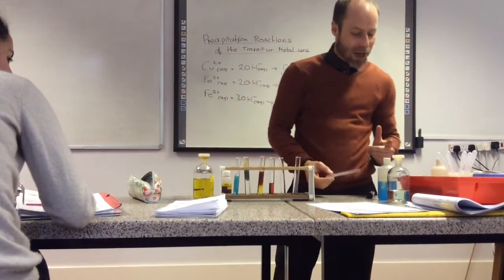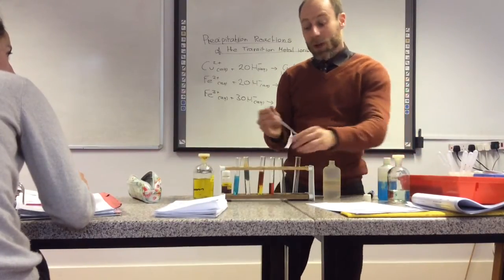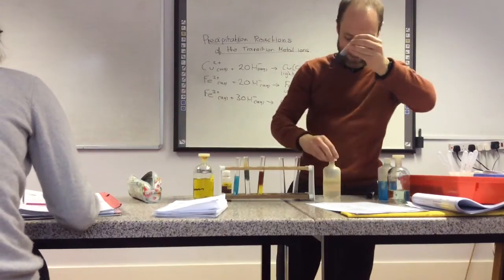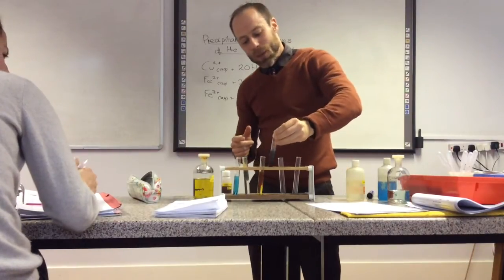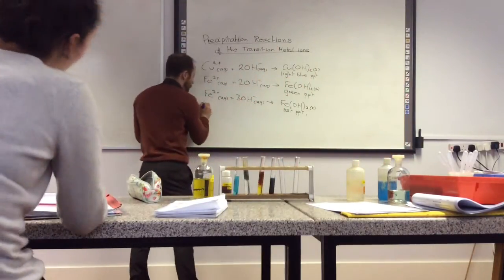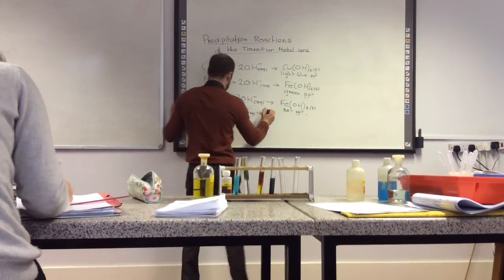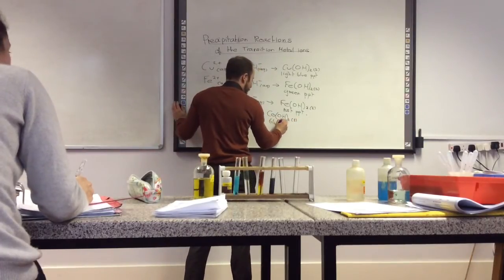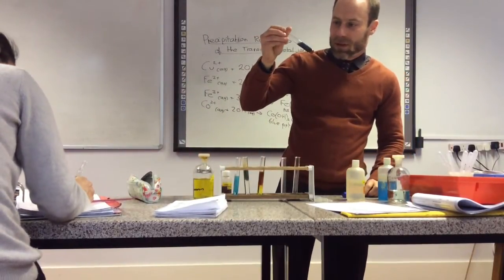So we're going to add — can anybody tell me the colour it's going to go? Colourless? Or pink? You'd think it was pink, wouldn't you? Blue! Blue, yes. Ta-da! That's blue. So we're going to leave that one because we said something will happen on standing — it'll go pink. We'll wait and see; it does take a little bit of time. So cobalt 2+ aqueous plus two hydroxide ions in aqueous gives cobalt 2-hydroxide solid, which is a blue precipitate initially, but it does sometimes go to a pink colour.